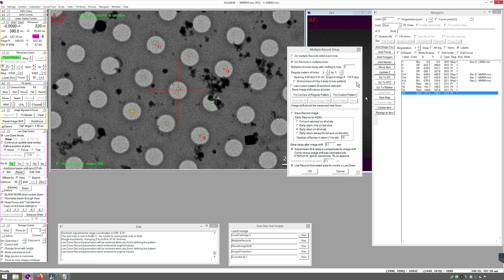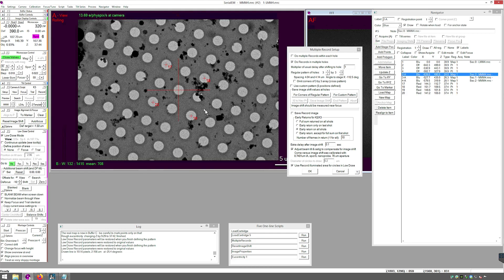Once that is complete, your 3x3 Multishot Pattern will appear. If you need to adjust the position of any of the points, lay a new set of four or use Edit Mode to adjust them. If you are going to do multiple records within a hole, you can set that up — see one of our Multishot videos. Make sure that Adjust Beam Tilt and Astigmatism to compensate for Image Shift is calibrated. After you have defined the four corners of your Multishot Pattern, you can increase the Defocus of View back to its original value. Press OK to close the Multiple Record Setup box.